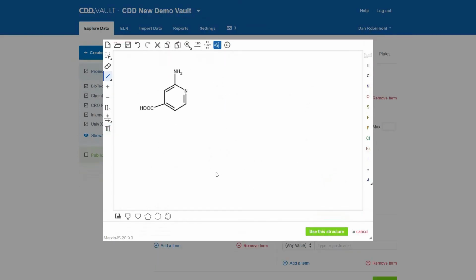All right, and then the last aspect of searching is the wildcard atoms. I can, for instance, make any atom here for my query. This will find anything with this configuration with any non-proton atom at this position. The other magic wildcards are a Q for heteroatoms, which is any atom except for carbon or hydrogen, and there are metals here, and also halogens. This is any halide, bromine, chlorine, fluorine, or iodine.